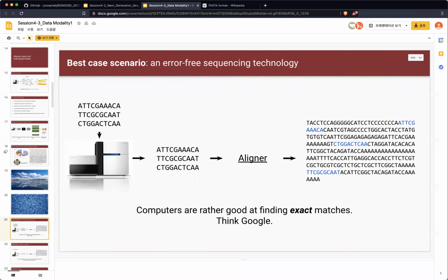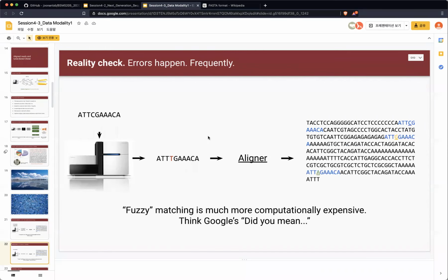But unfortunately, with the current technology, you can only read 100 or 200 base pairs, and then sometimes this read has error information, right? So if you put one DNA sequence like here, and one of the positions here has a T, this is an error, right? So this is not the nucleotide from nature, so this is not existing in that person's sample, right? But then the problem is your data cannot tell you at first whether this information is a mutation or an error, right?